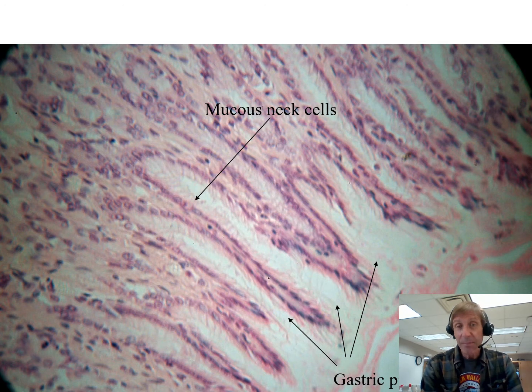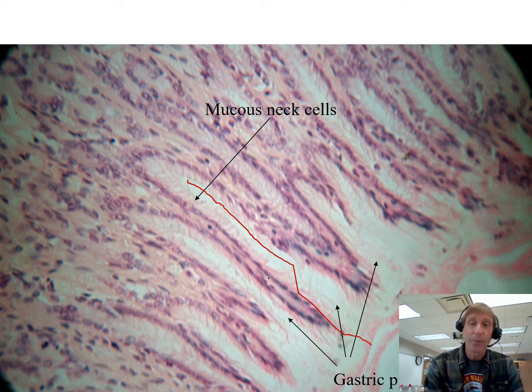This is just a higher magnification of the same slide. You're seeing the gastric gland right in here is its lumen, and the pit comes out here. This is the lumen of the stomach out here somewhere, kind of where I am. Just higher magnification. I don't distinguish between the different types of cells, so you'll have a few high magnification slides of the stomach, looking at the cells that secrete different things, like the mucus and the pepsinogen. They're a little too hard to distinguish, so I typically won't use them. They're on here in case somebody wanted to.